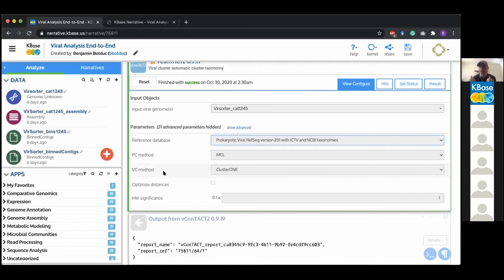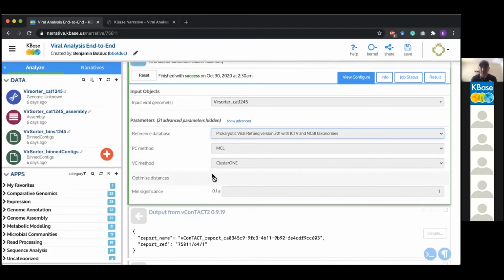They want to dive as deep as possible. And what optimized distance does, and so we actually went through a lot of work to hand curate the optimal distance in order to get the standard scaled data sets a few years ago to the genus level.